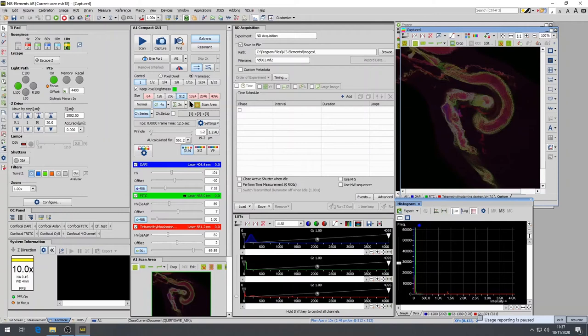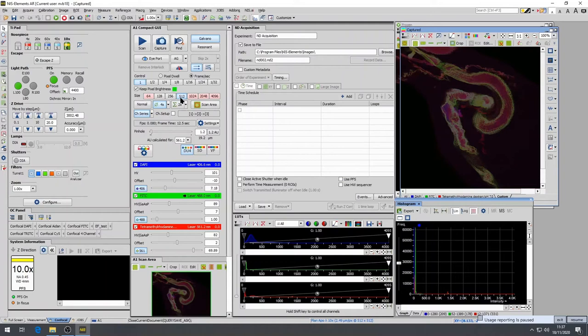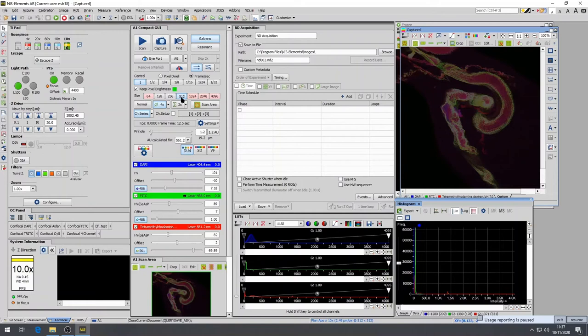It is possible to change the XY pixel size to improve image quality. The Nikon A1R uses a 512 pixel by 512 pixel image frame by default. While this is adequate for most users and applications, the image quality can appear to be lacking. To improve upon this, it is useful to increase your sampling rate or your XY step size. This can be increased in two ways.